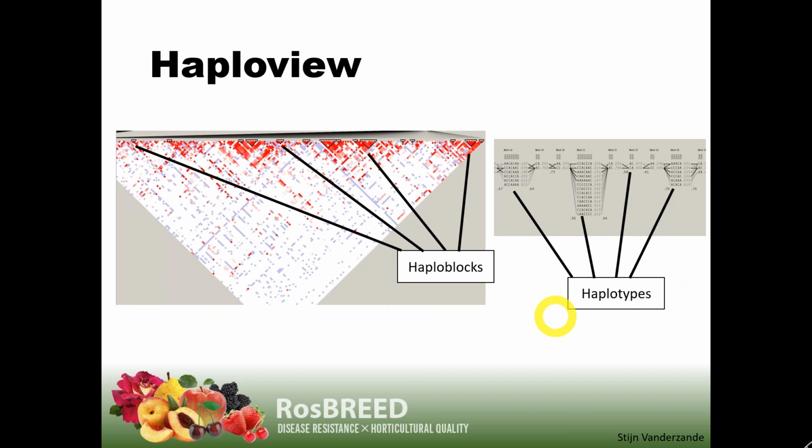if you're working with this kind of population. And I've used HaploView before. I'm not going to go into too much detail, but this picture is one chromosome, and it shows how correlated alleles are between two loci. So you see all these little squares, and it's slightly easier to see here where you have this one individual red square, but there are all these squares all across this pyramid. And what it means is the color gives an indication of the correlation between the alleles of two loci.